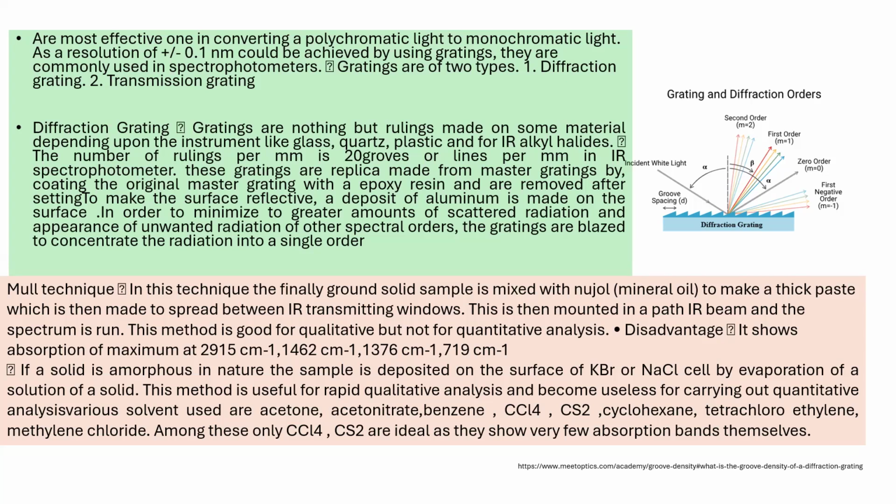So you are going to have 20 grooves to 100 grooves per millimeter. You have different types of diffraction gratings, and their efficiency also is going to change with more grooves or lines per unit distance, that is right?